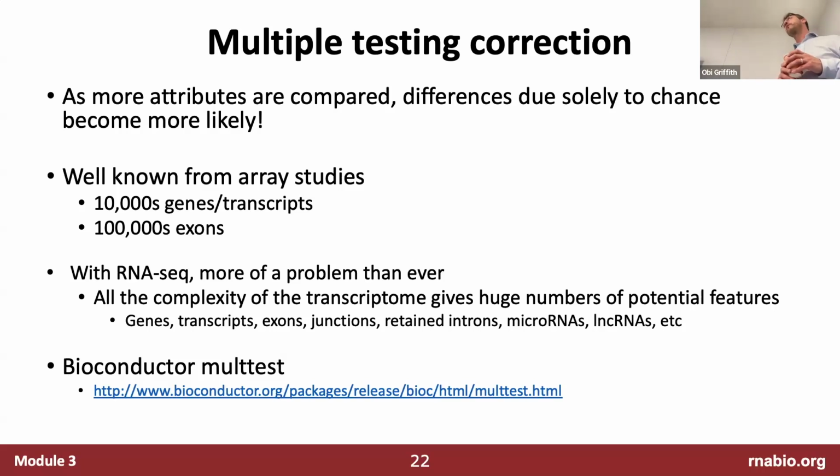I am familiar with RSEM being a thing, but I've never used it. I think there are RSEM differential expression packages that are fairly common, and maybe this was part of a pipeline that TCGA used. But I don't know the details of whether you can extract raw counts. I think you can, and then you could put the raw counts through these. That's what you would need to do, probably.